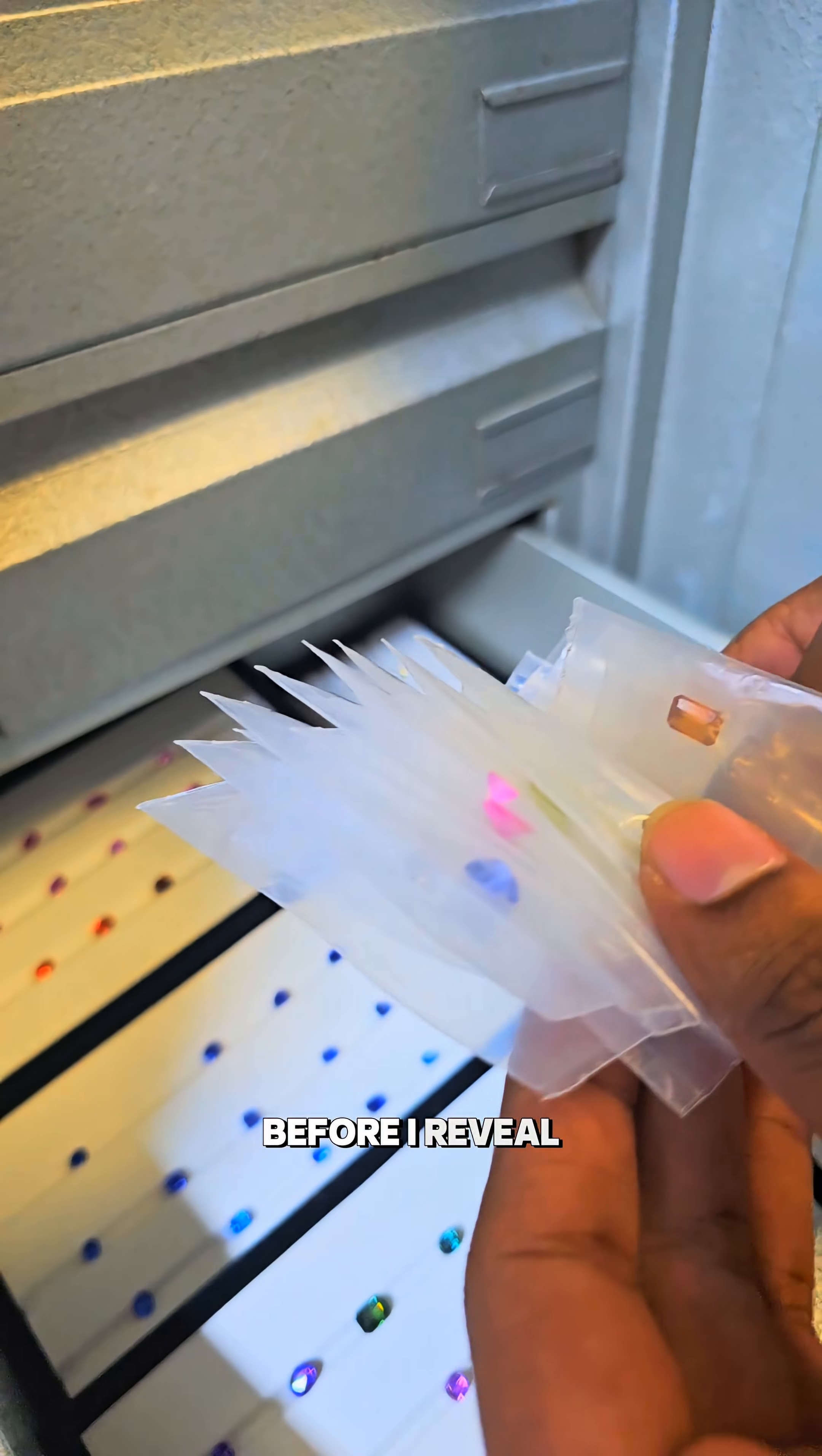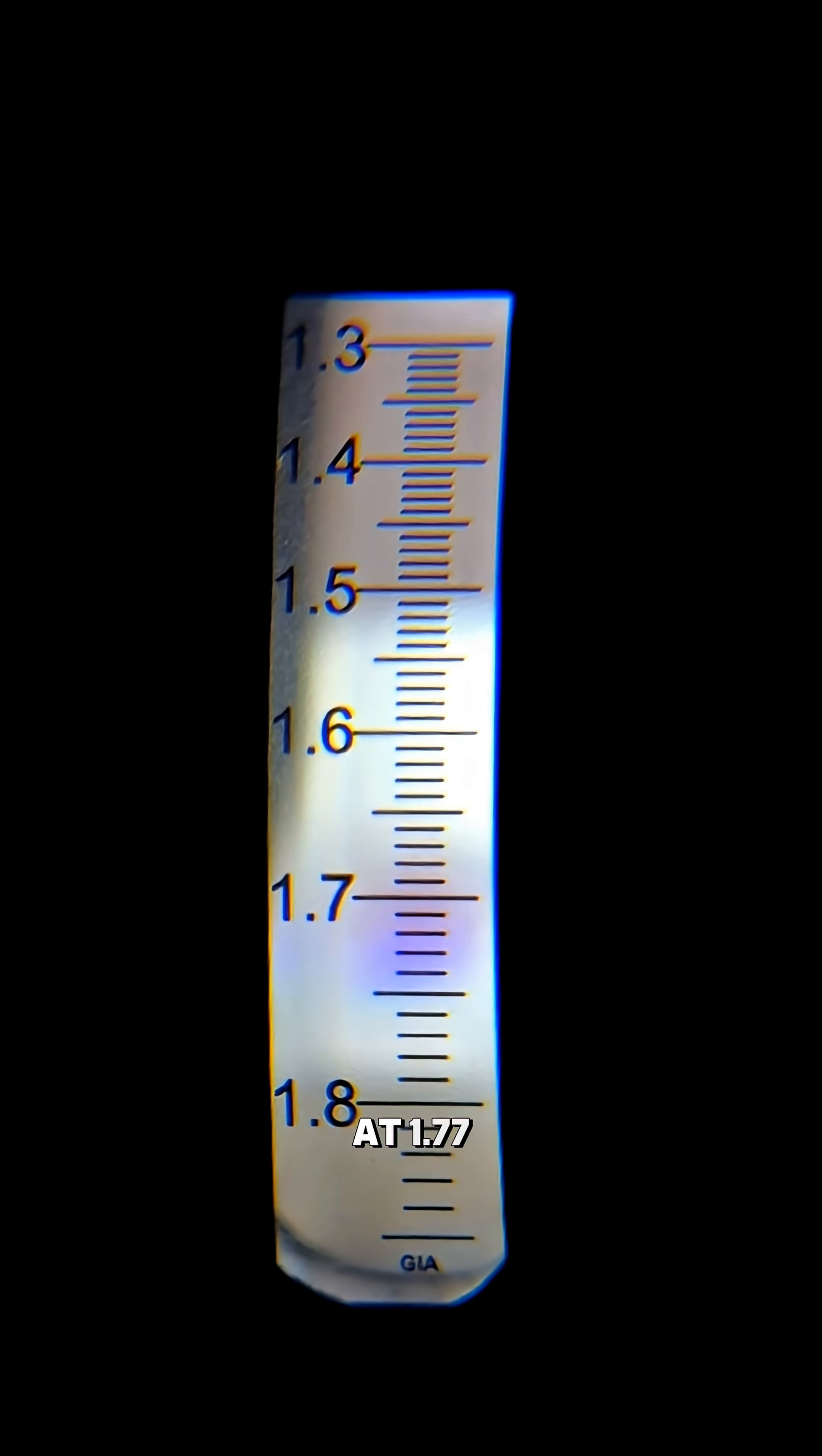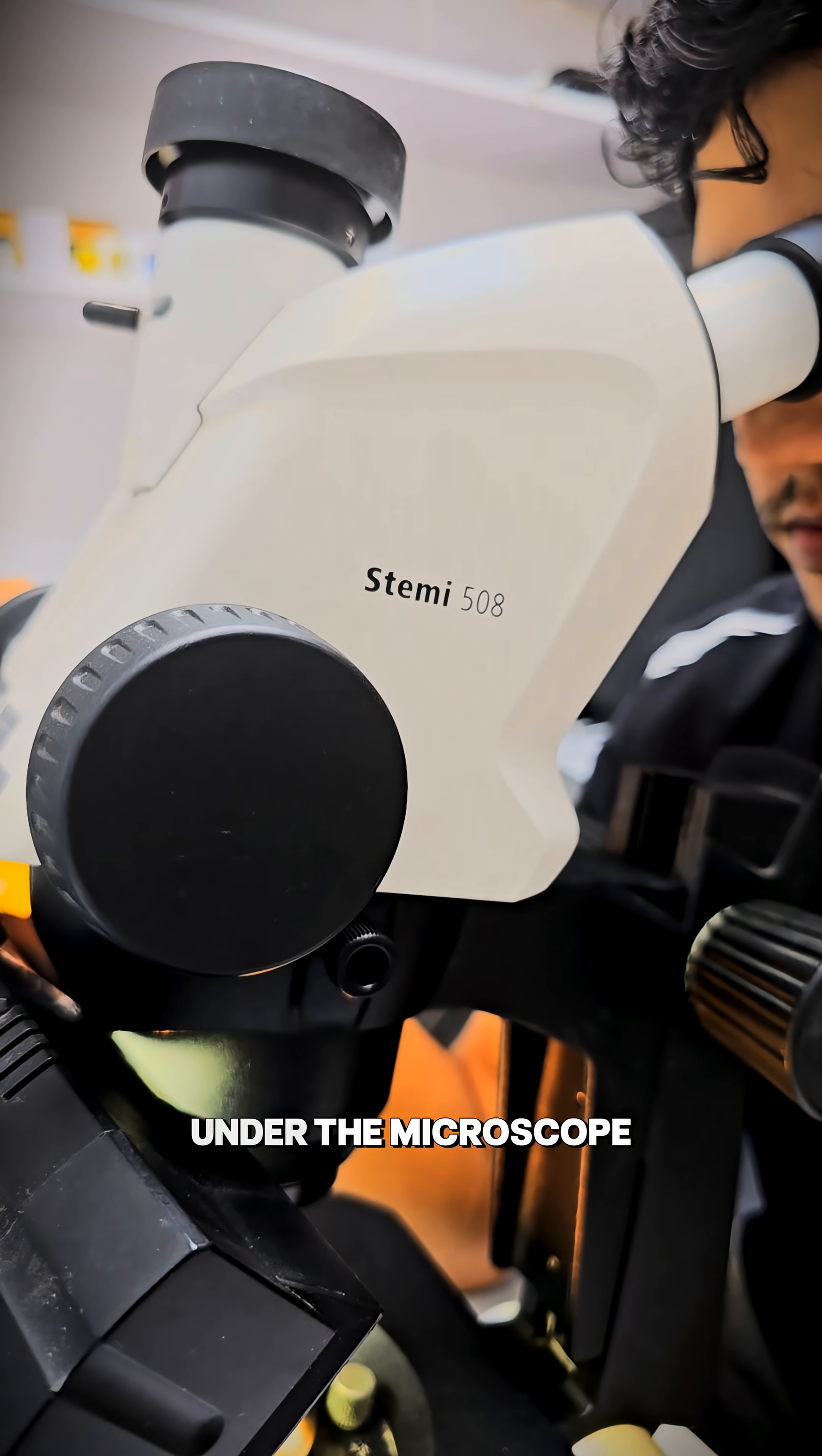Before I reveal if this sapphire is heated or not, make your call. First test: refractive index. Looking at the scale shadow edge at 1.77—that's corundum. Polarized scope to check the optical character: doubly refractive. Confirmed it's sapphire. Now under the microscope.